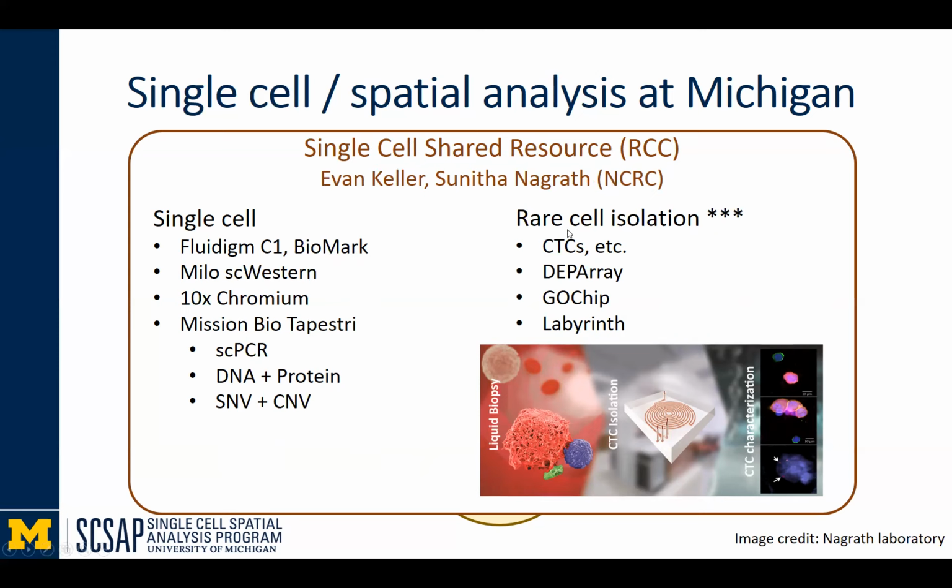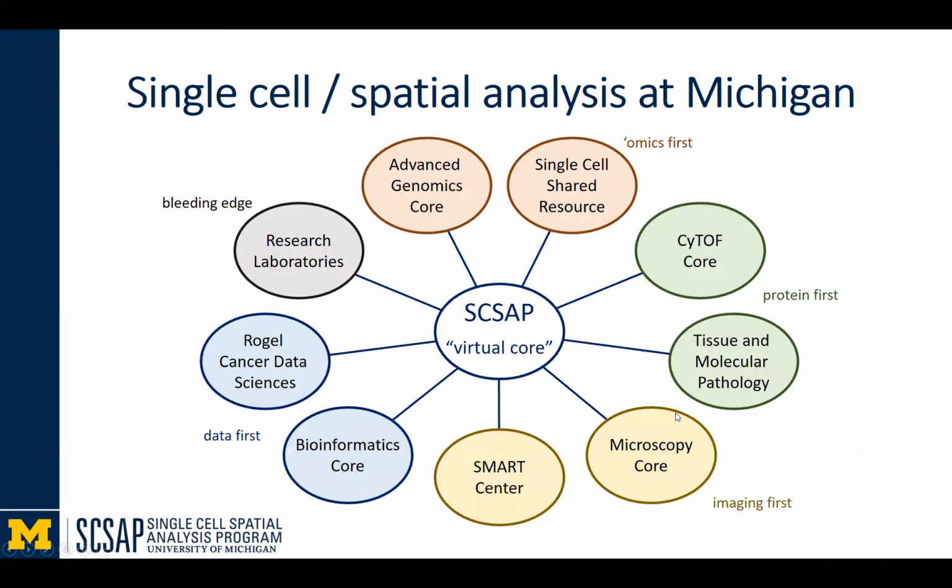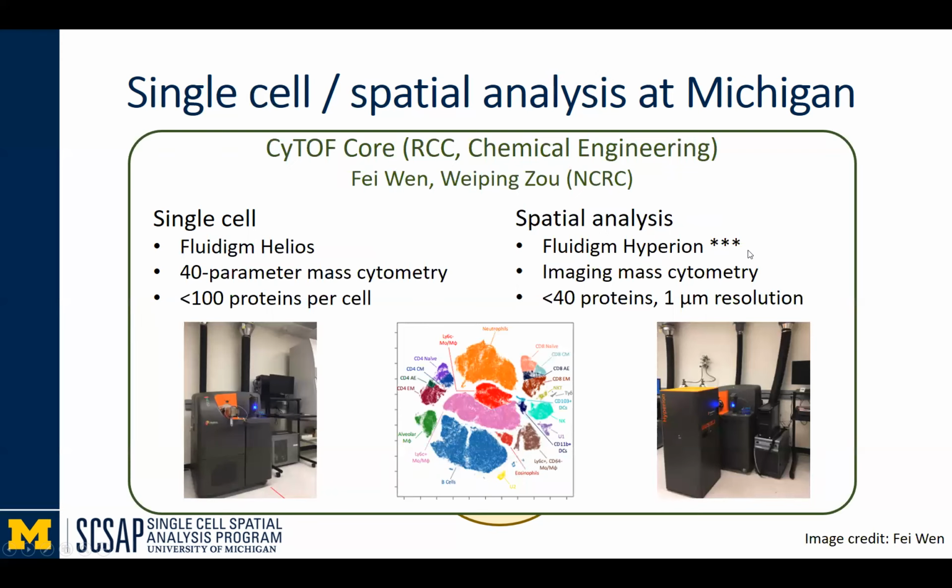But the shared resource also has a focus on rare cell isolation through technologies indicated here. And Sunitha Nagrath will be talking about some of their work, with techniques such as the Labyrinth pictured here. Great. So those are the omics first sites. Then I'll move to what I'm going to call the protein first sites.